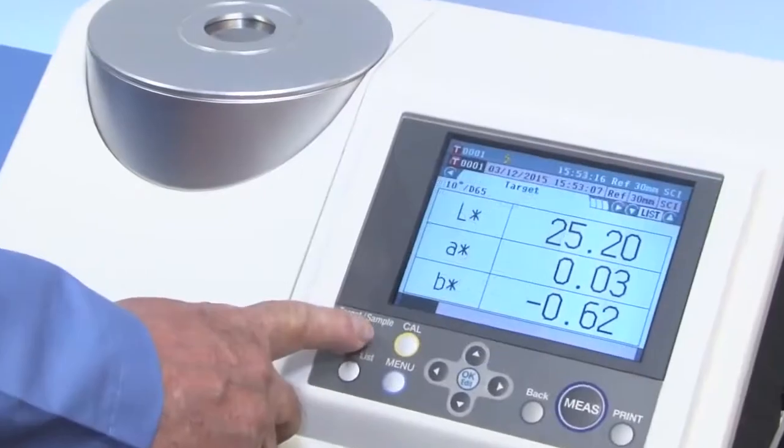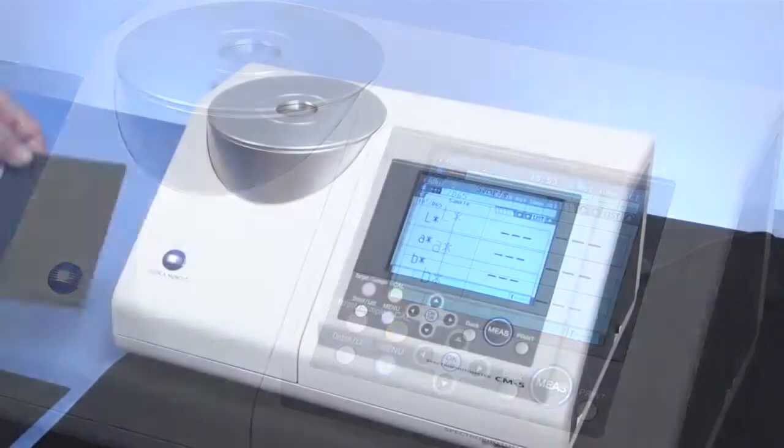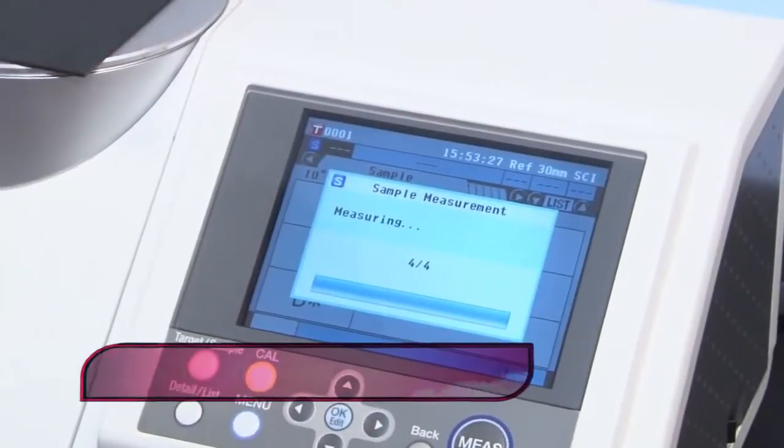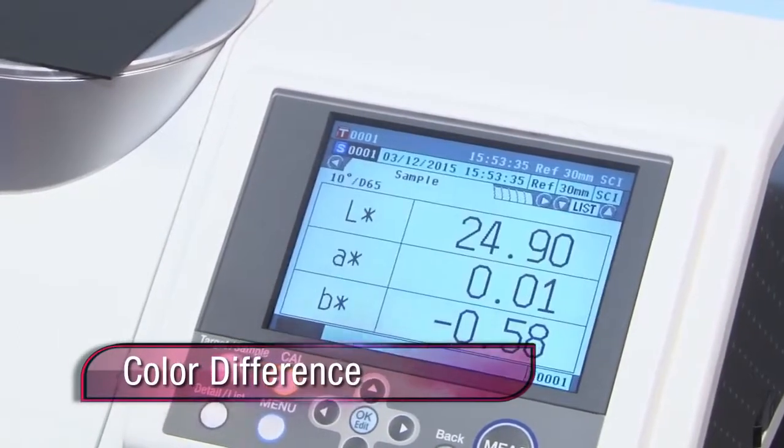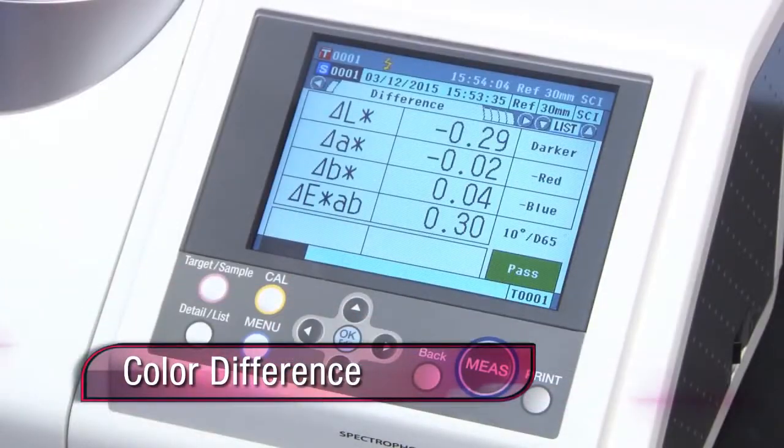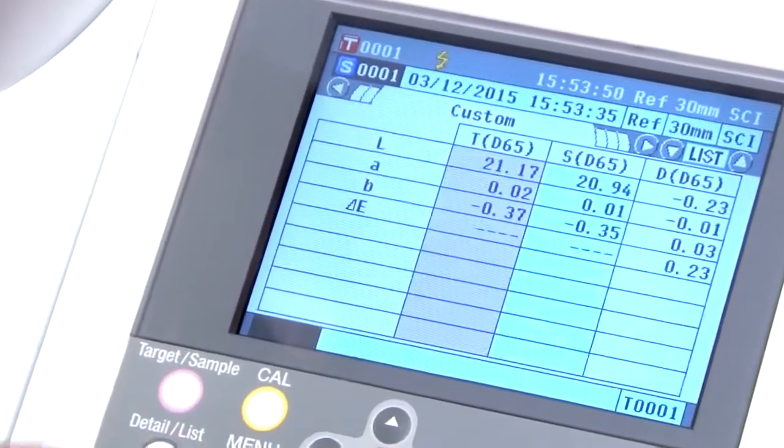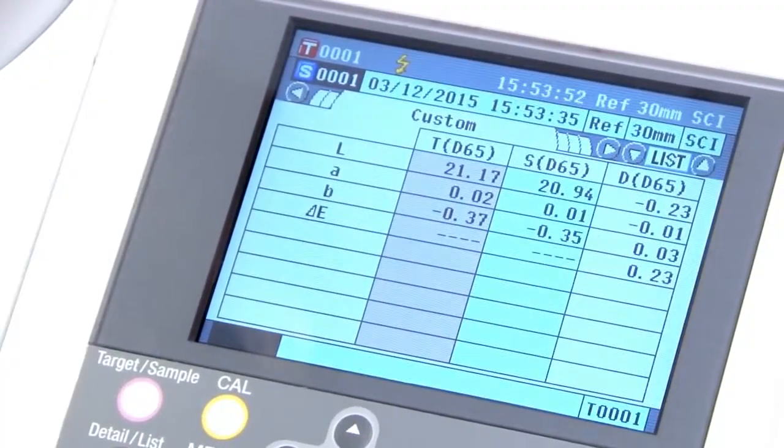For color difference, measure the sample color and the standard color. Then save the values for each measurement. The differences between the sample and standard are calculated using the resulting colorimetric values. Differences are shown numerically to identify color inconsistencies between products.